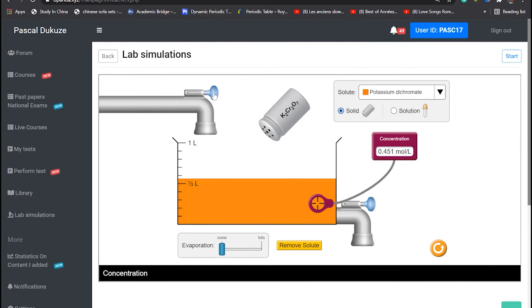And if you add more water, the concentration decreases because you are increasing the amount of our solvent. We reduce the volume again, and when we add water, an observable change is made: as the concentration decreases, the solution becomes pale in color.